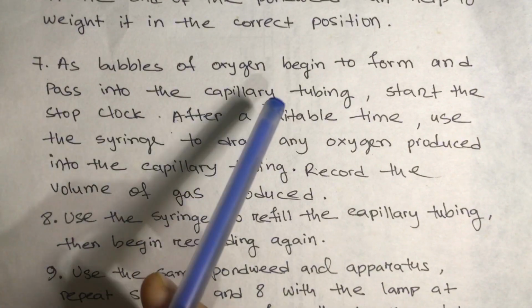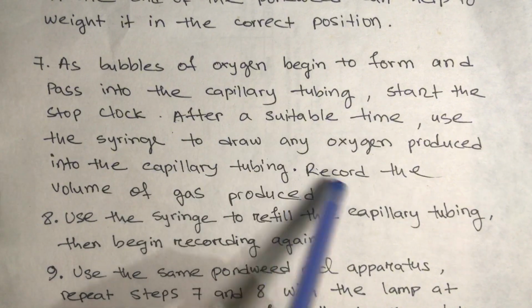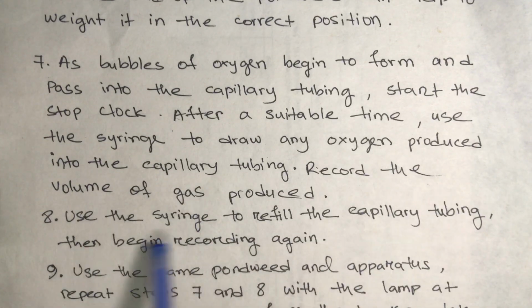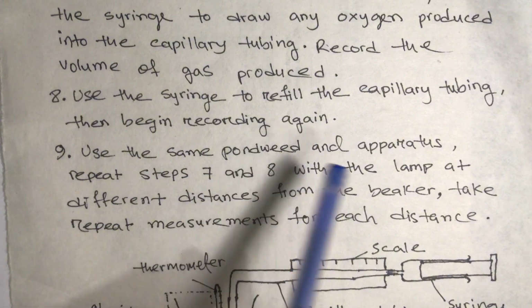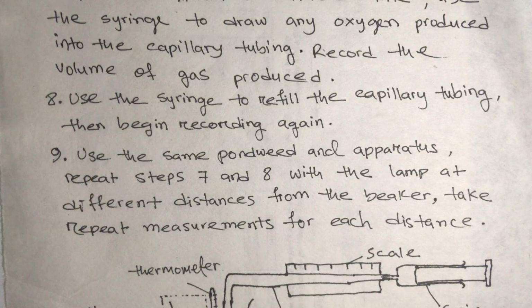As bubbles of oxygen begin to form and pass into the capillary tubing, start the stop clock. After a suitable time, use the syringe to draw any oxygen produced into the capillary tubing. Record the volume of the gas produced. Okay. Use the syringe to refill the capillary tubing, then begin recording again. Use the same pondweed and apparatus. Repeat steps 7 and 8 with the lamp at different distances from the beaker. Take repeat measurements for each distance.